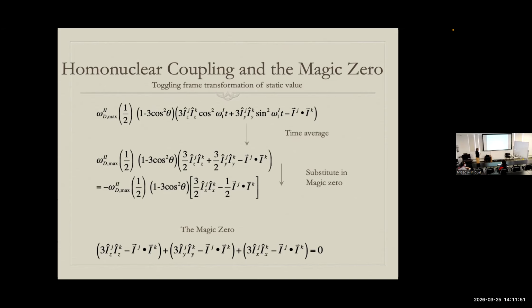So this is time average. It's the first step. So we have cos squared omega t. Do you happen to remember what the average of that is? The average of cosine omega t is 0. The average of cosine squared omega t. Have you ever thought about that or needed that for another problem? This is like a rectifier. You take a cosine function and multiply it by another cosine function. And now you have something that's always positive. So it's not going to average to 0, right?